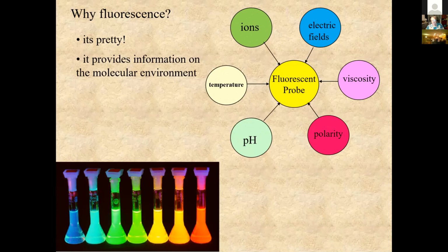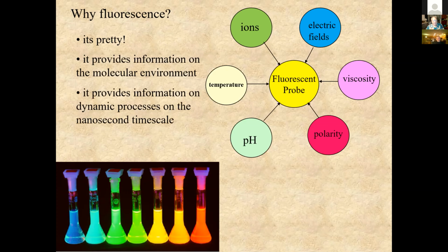Certainly, fluorescence can provide information on molecular environments. In fact, fluorescence probes have now been developed, as you'll learn, that can probe almost any chemical or physical environment, such as viscosities, polarities, pH, temperatures, et cetera, et cetera. And you'll learn about many of these probes.